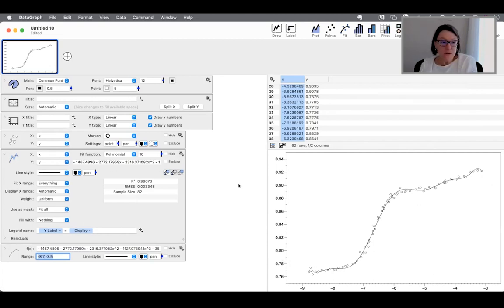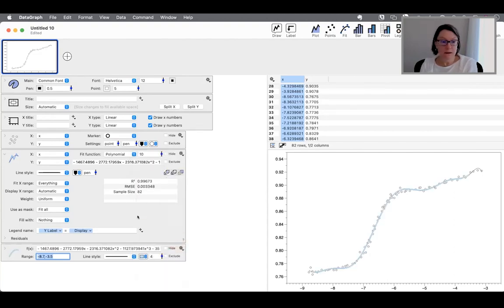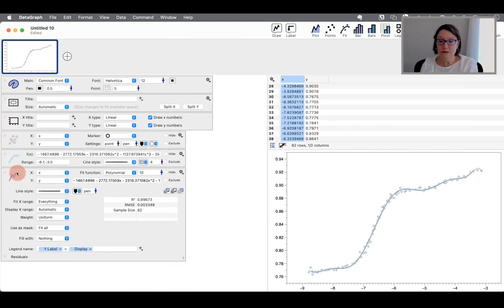But the line that you see from the function command, let me make this a different color and then move this to the top. If I make this really wide, and I'll also make my line from my fit command a little bit wider so you can see this, then these two lines clearly match very well. And so there's no problem here.